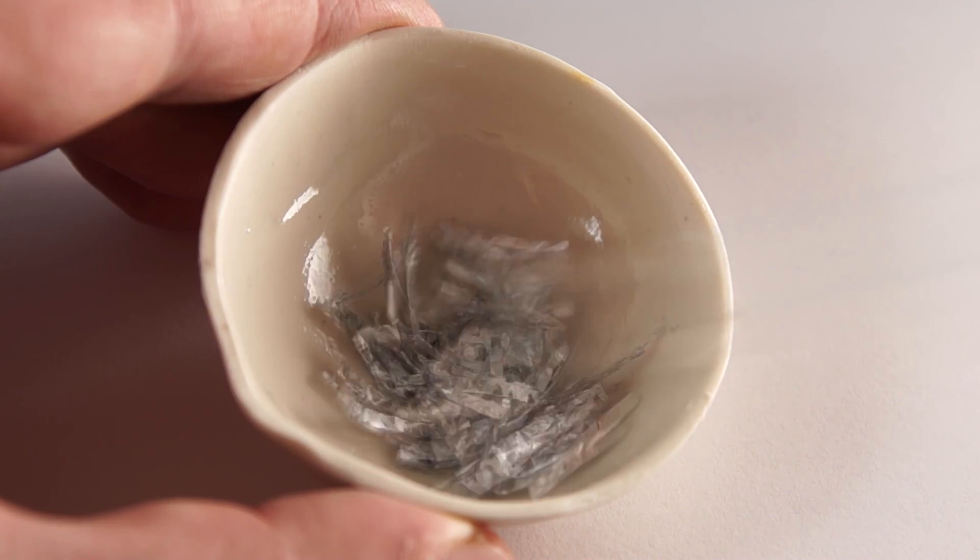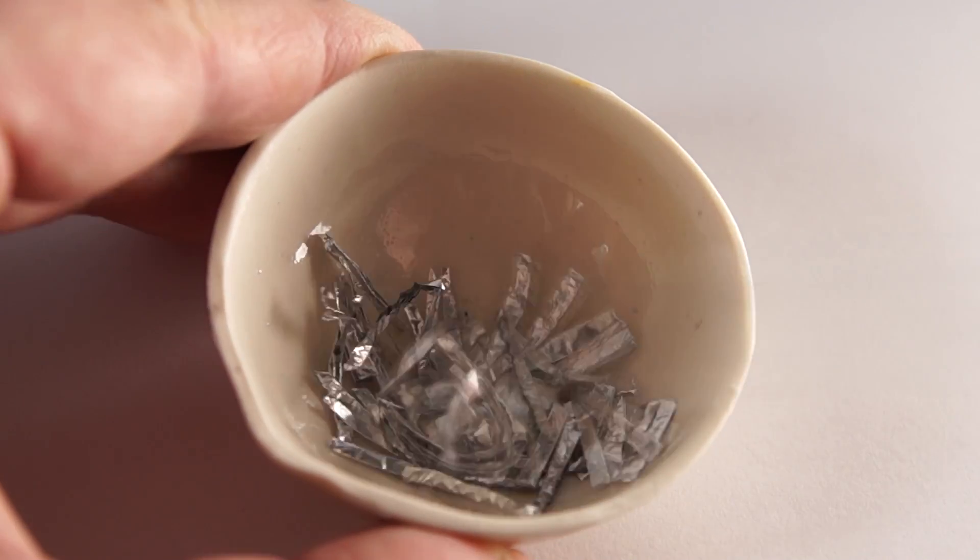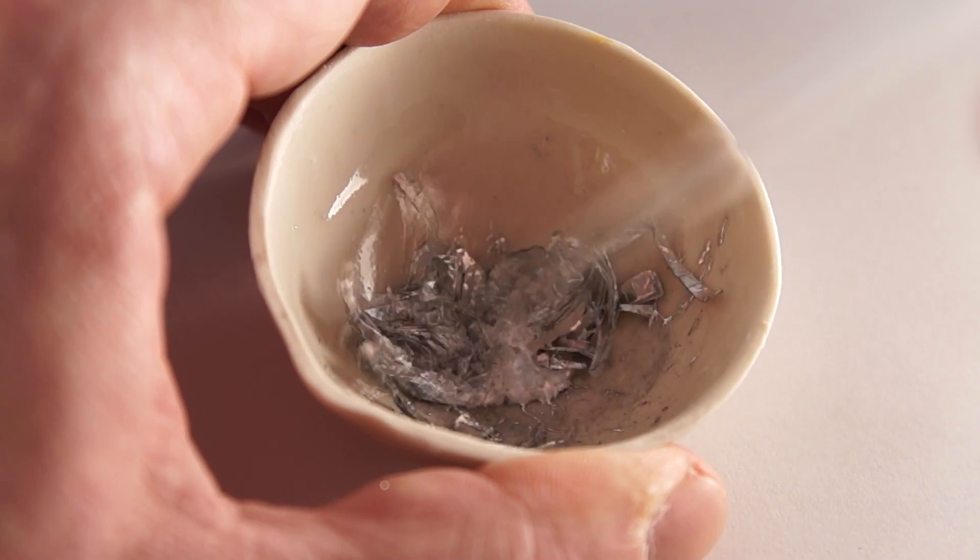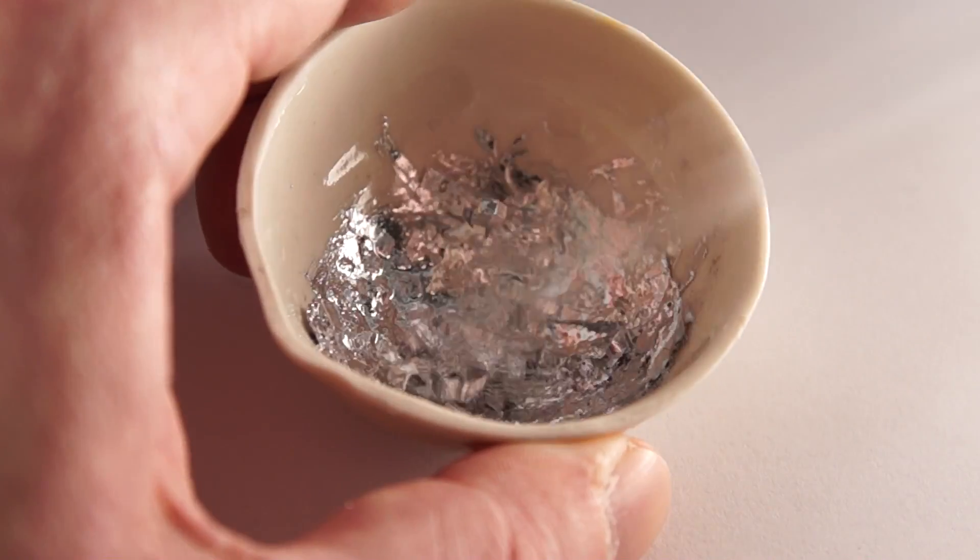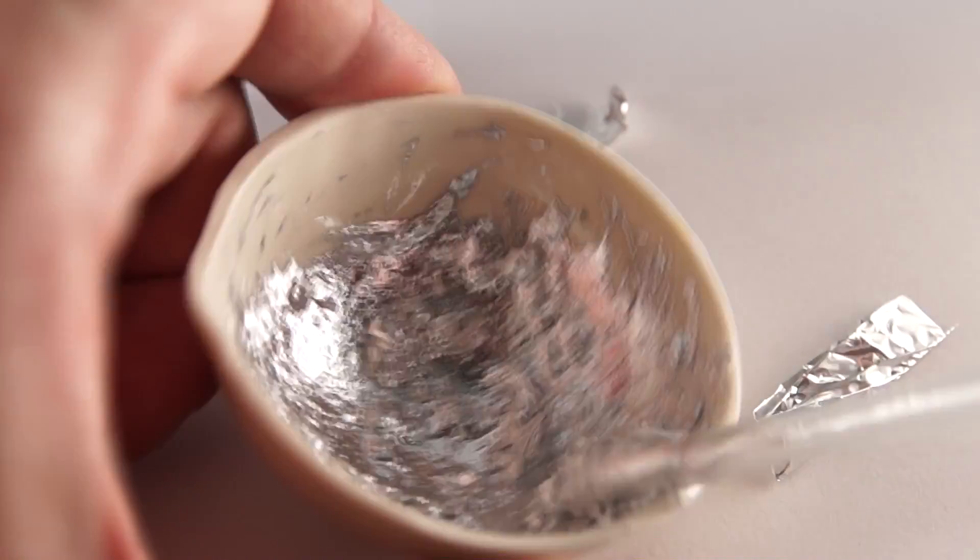Over time, you will notice that aluminum begins to dissolve in gallium and foil turns into a silver slurry. This paste is an amalgam of aluminum and gallium which has an unusual property.